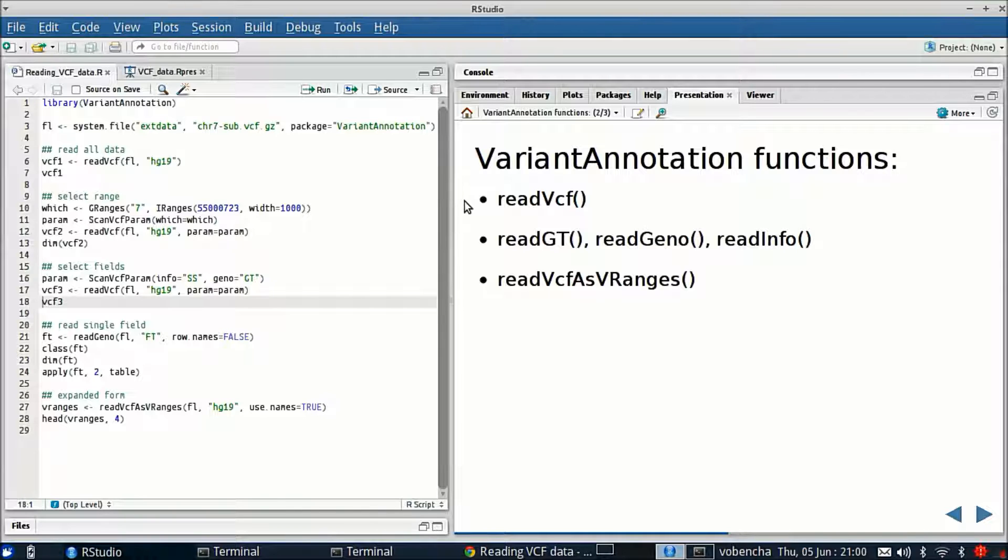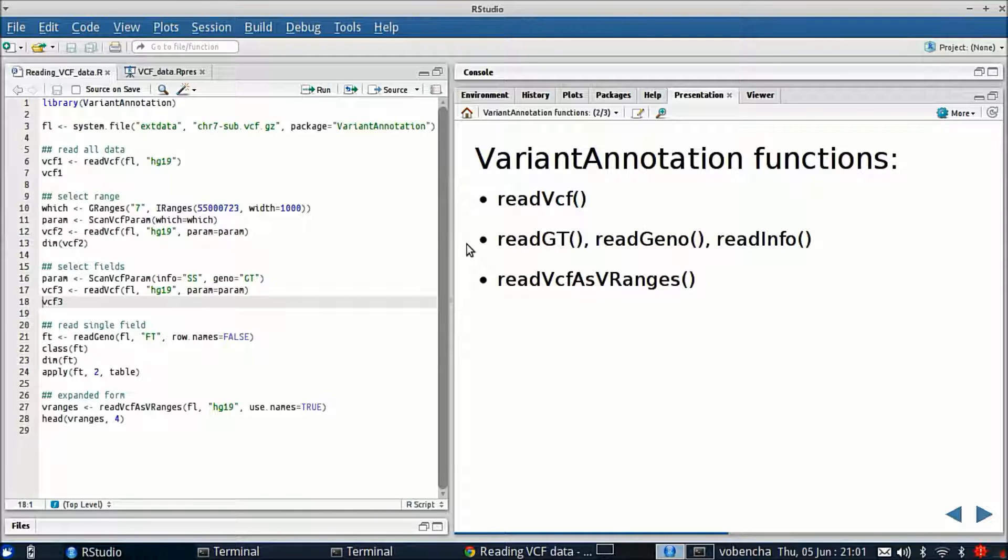ReadGT, ReadGeno, and ReadInfo are more lightweight forms of the read function, so they don't read the data into a VCF class. Instead they read in a single variable as numeric or character, maybe a vector or matrix depending upon the dimension. It's a more readily computable form of the data and again just a single field.